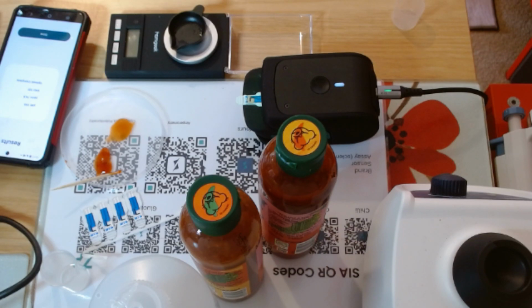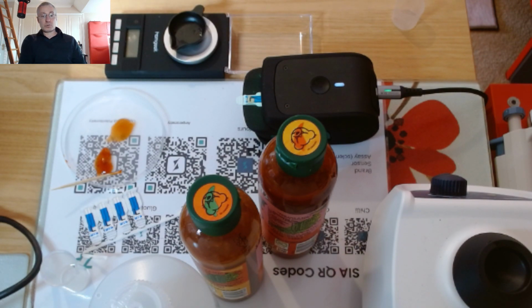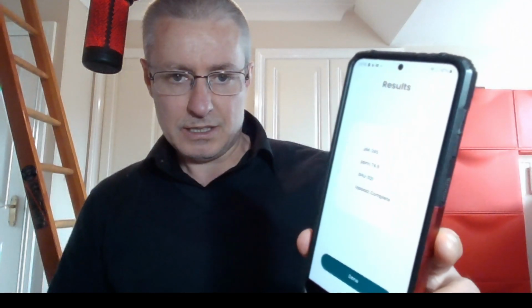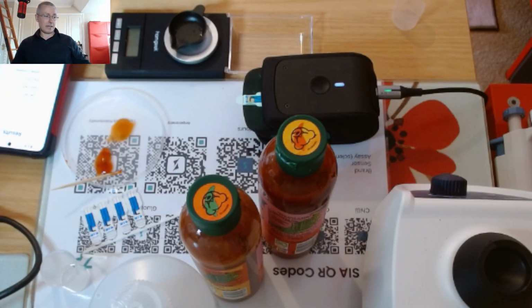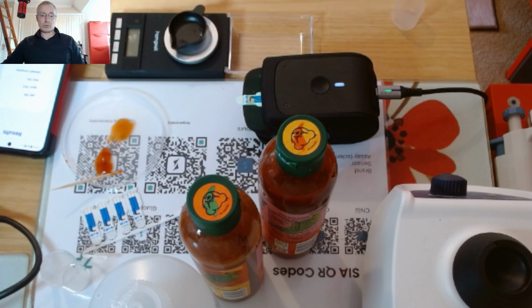So it has come to completion, and it's come back with a result of 1,121 Scoville heat units. When I measured the other sauce, it came back at 618, I believe it was, Scoville heat units. I'll just change cameras here. My apologies, I'll just read it myself: 1,121. It's clear that the Xtra is hotter. There are some physical signs that it's got more jalapenos, obviously, but the Scoville heat unit reading also says, yeah, this is a little bit hotter.